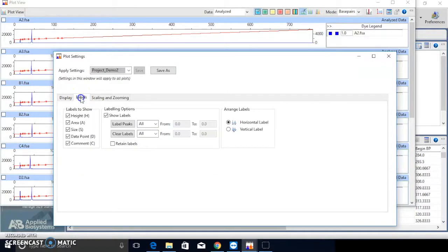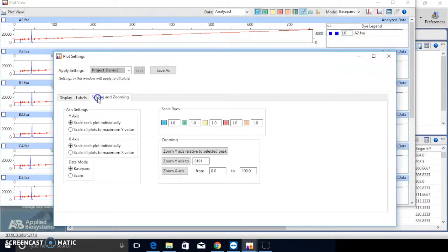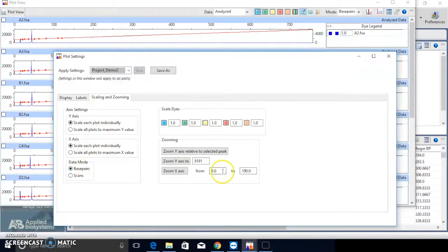The default settings for Label. There is no change here. There are two data modes under Scaling and Zooming, Base Pairs and Scan.